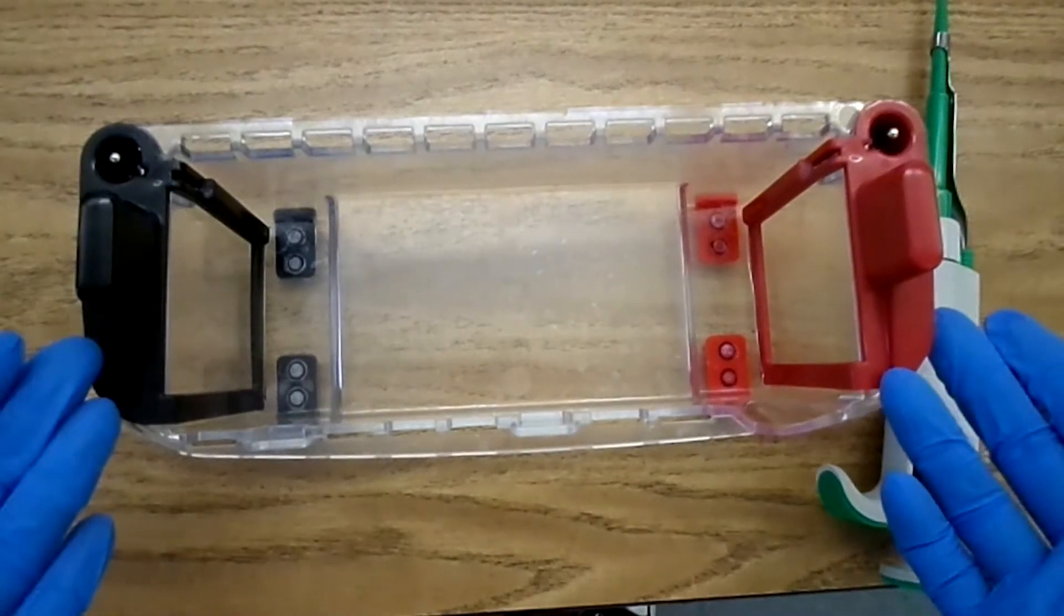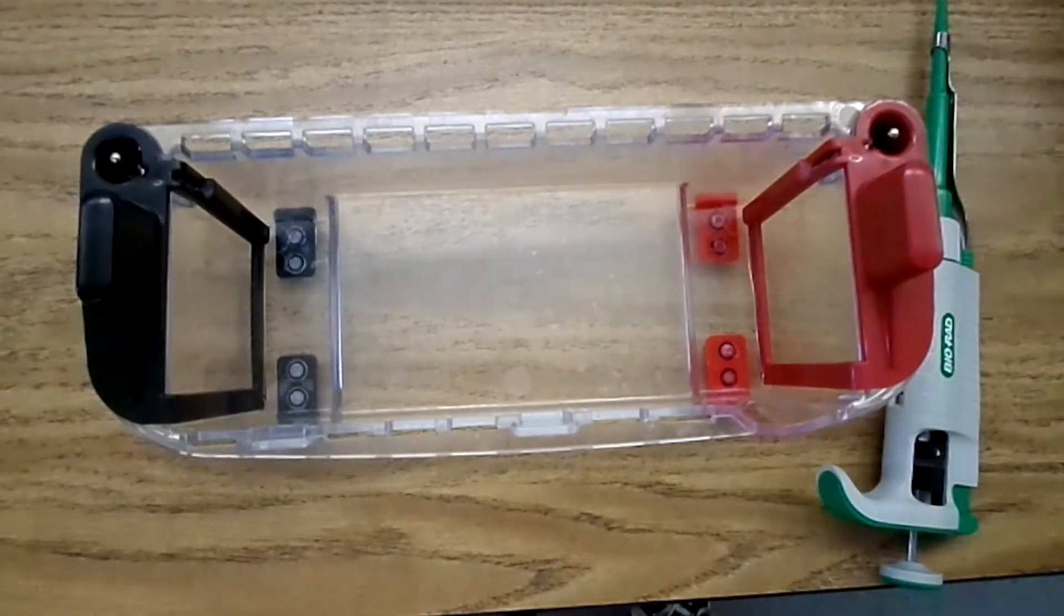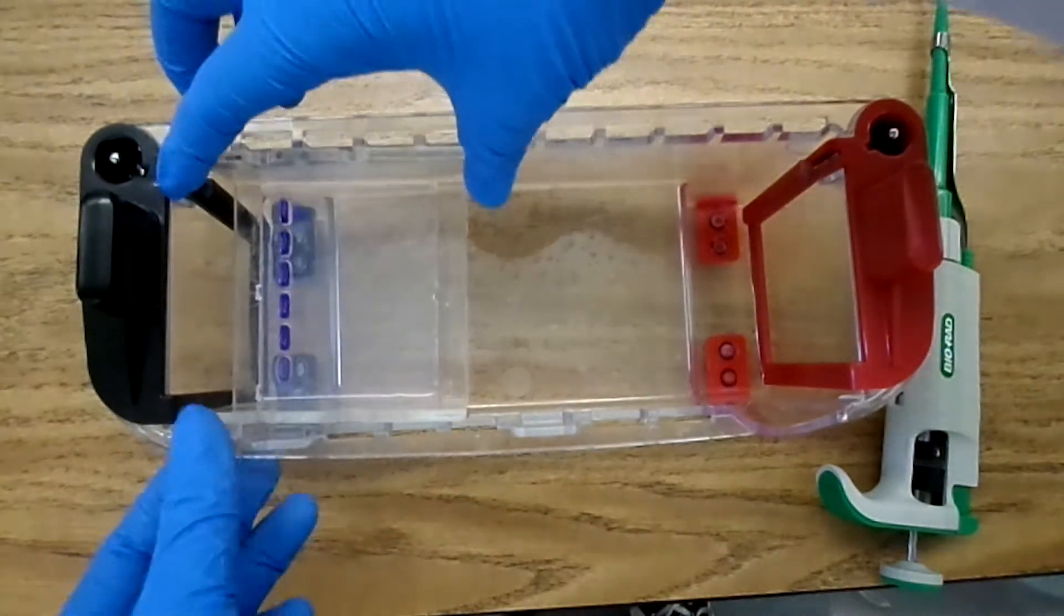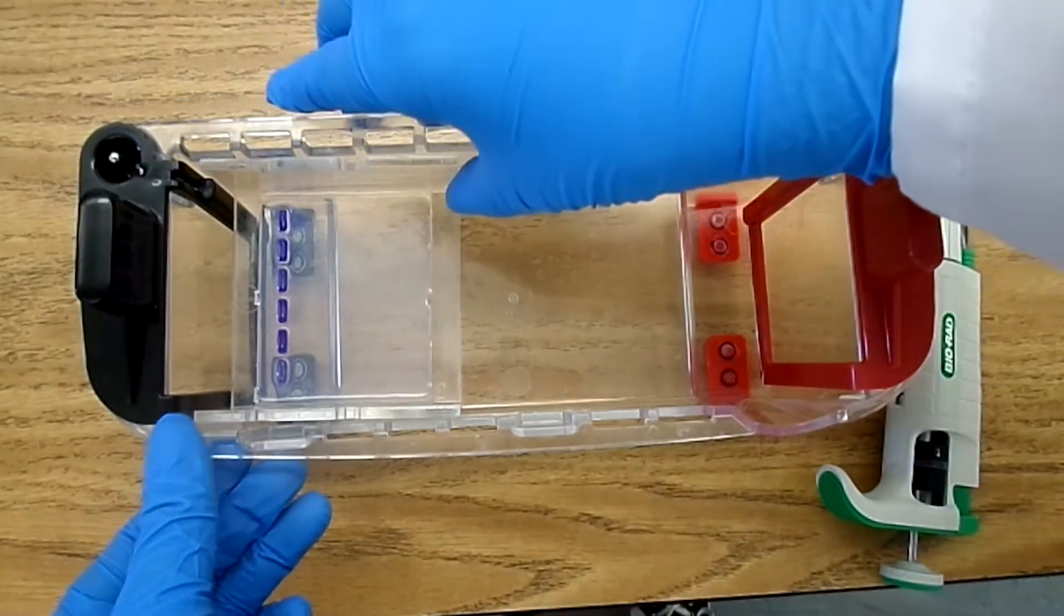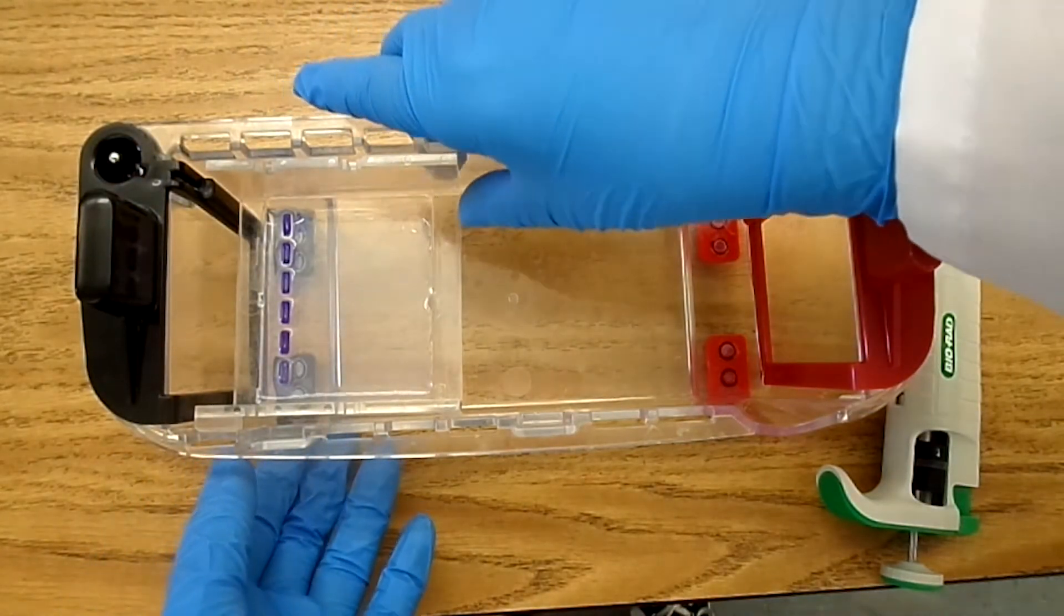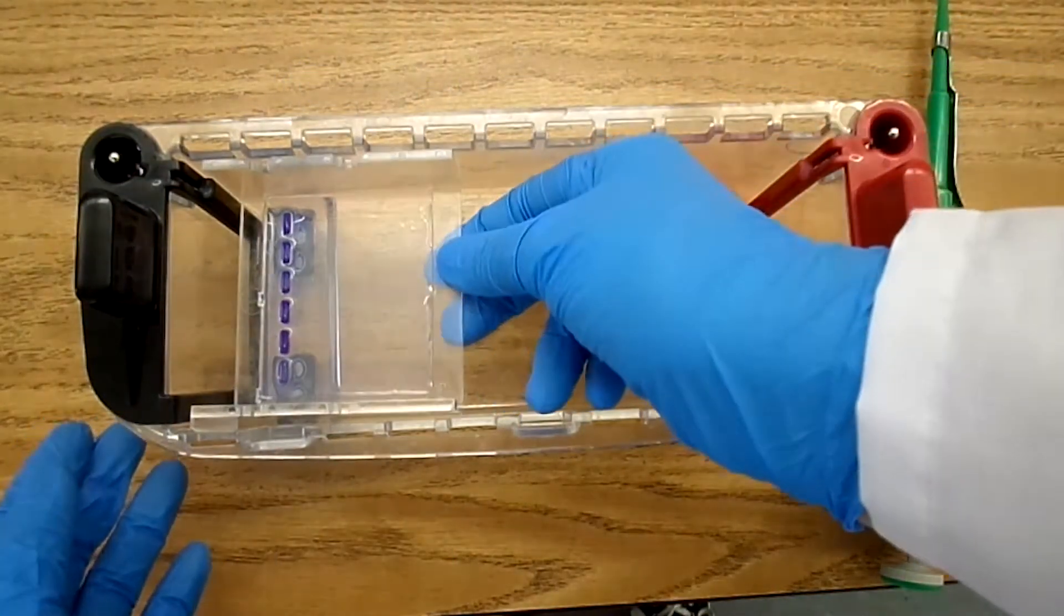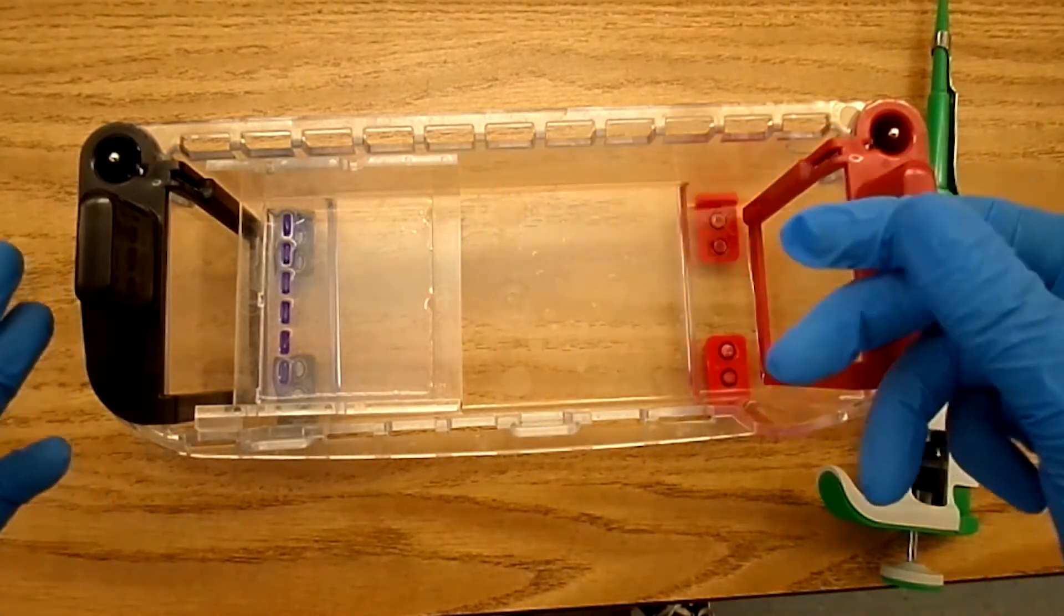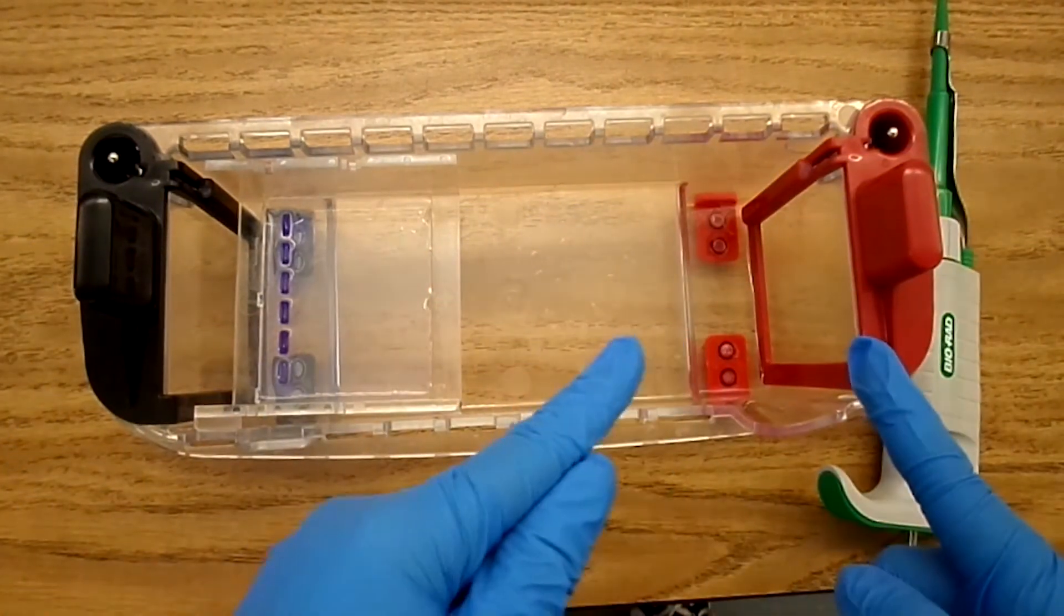This is our gel electrophoresis chamber, and we are going to put our loaded gel right here with the wells near the negative side of the chamber. That's because our DNA has a negative charge, so when we run the electrical charge through here, the DNA will move towards the positive side.